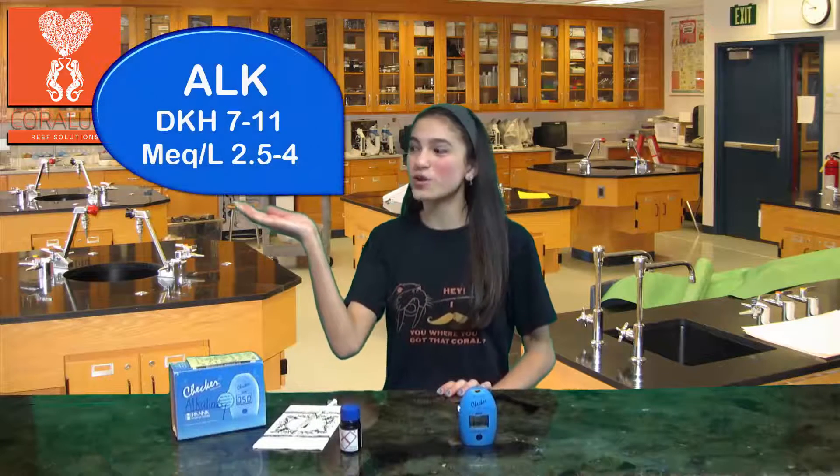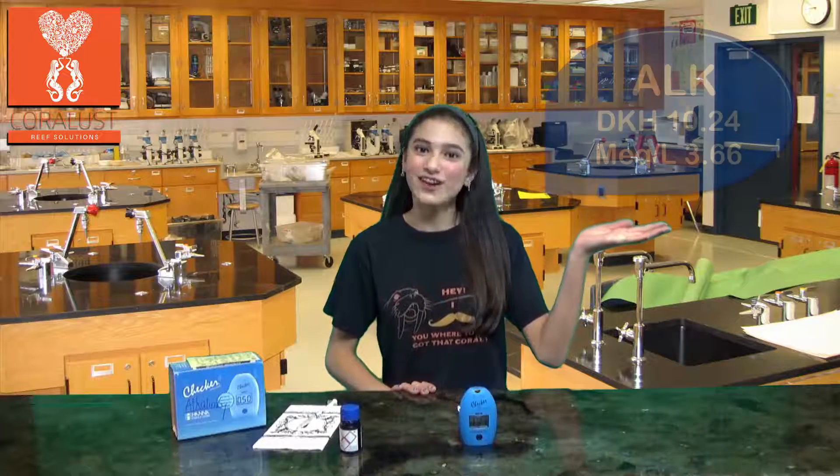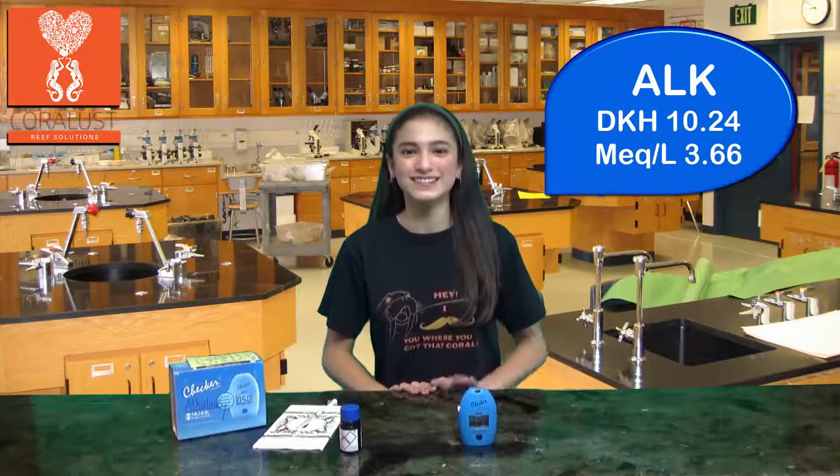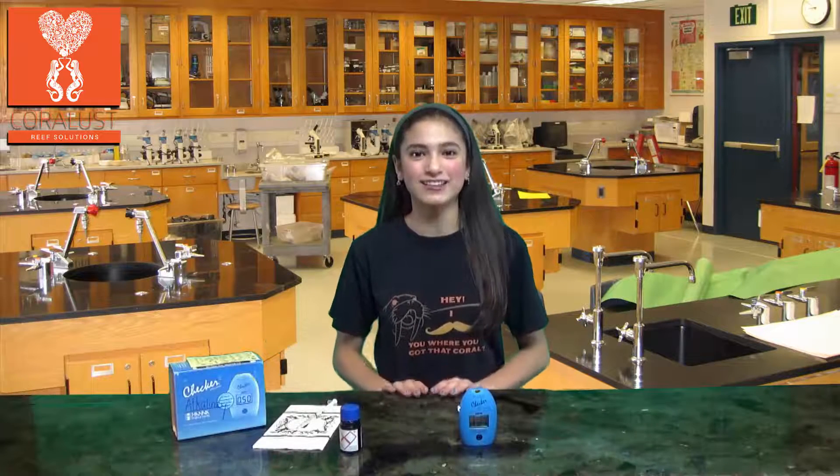Here is the normal range for alkalinity in a reef tank. Here are our results — pretty good. And that is how you use the HANA Checker to test for alkalinity.